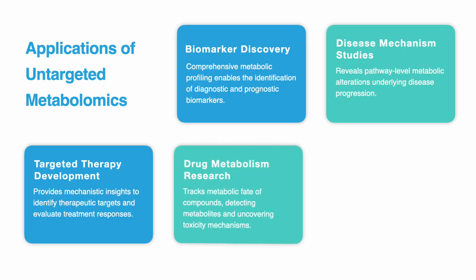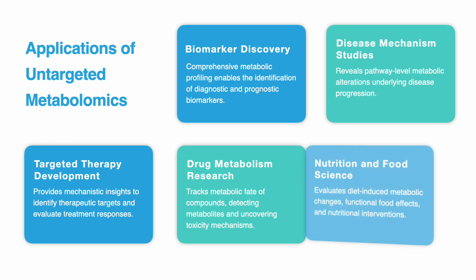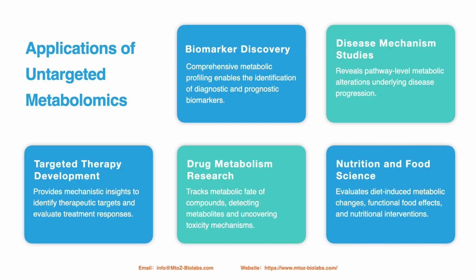At the same time, drug metabolism studies benefit from this approach by tracking pharmaceutical biotransformation, uncovering unexpected metabolites, and clarifying off-target effects to improve pharmacokinetics and safety evaluation. Moving beyond medicine, comprehensive profiling monitors metabolic responses to diet and lifestyle, supporting insights into nutrient utilization, functional food effects, and personalized nutrition.